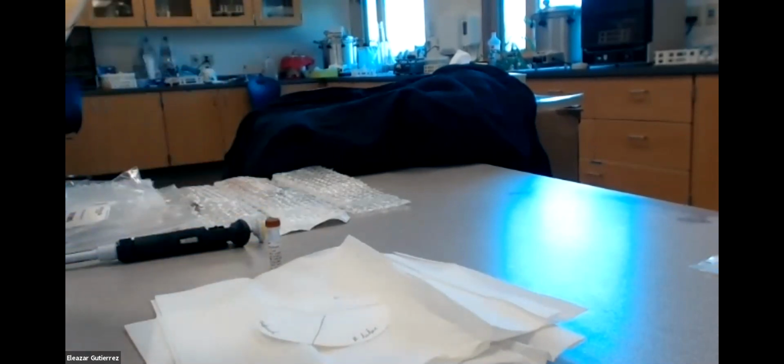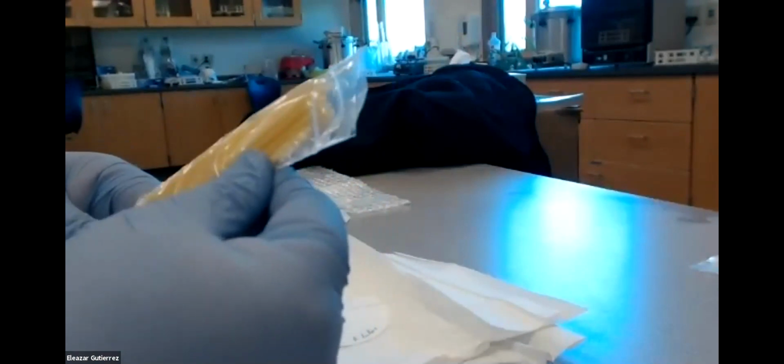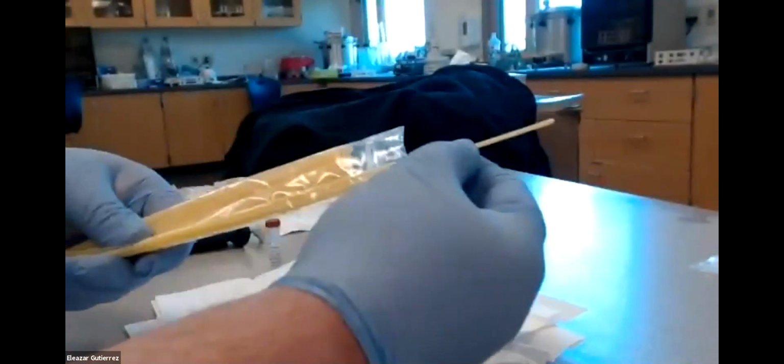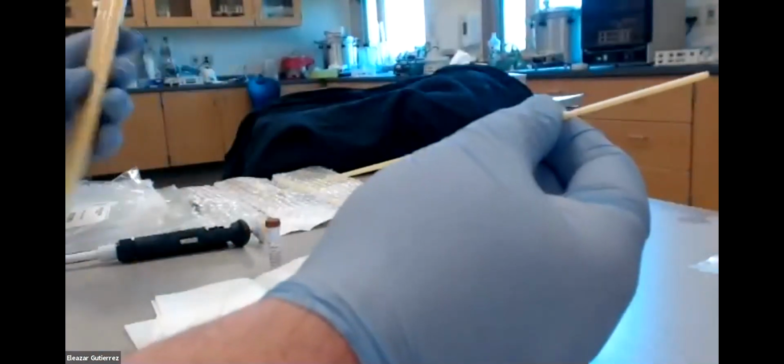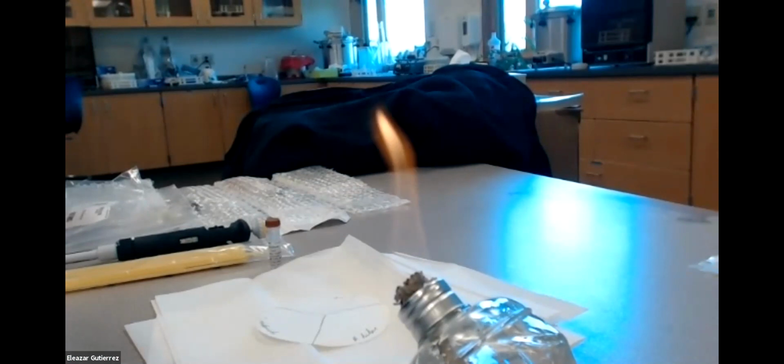Okay. So again, we're going to start with an inoculum. We're going to need these little guys, and we're going to go ahead and take one out. Okay, there it is. And we're going to need to light our little fire here. There it goes.